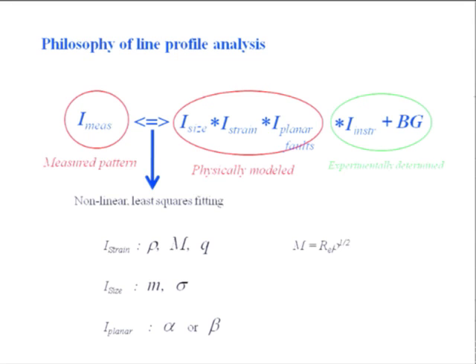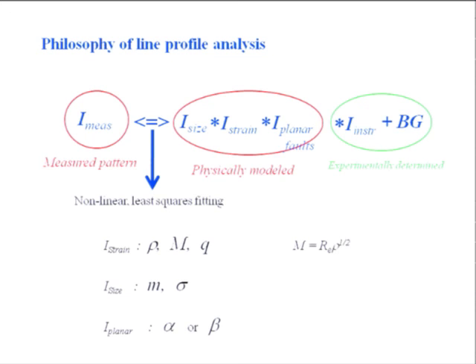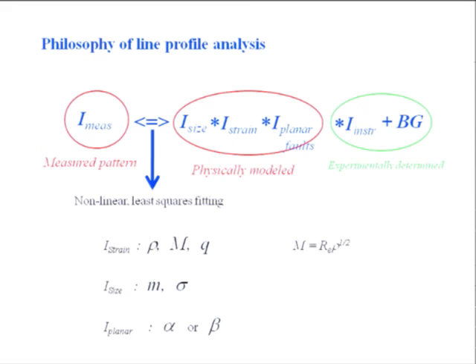We have seen before that strain can be characterized in terms of dislocation densities, or you need another parameter telling you about the dislocation arrangement. Dislocations can arrange in very different manners. I don't want to go into detail at this moment. And there is the strain anisotropy, which is well known to all of us in crystallography and in all Rietveld approaches or codes. Strain anisotropy is a well-known phenomenon, and this third parameter takes into account strain anisotropy, which can be based on a dislocation concept.